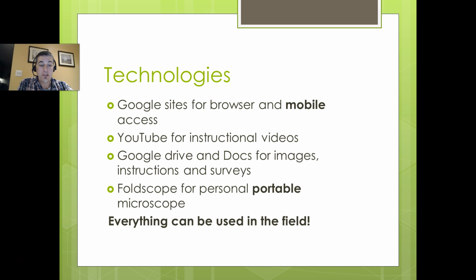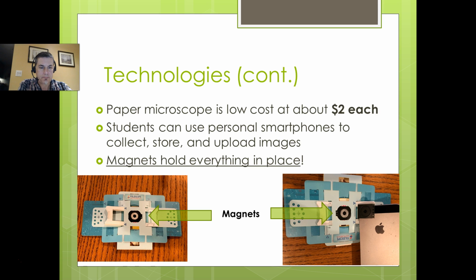Technology, like I said, everything is portable. I wanted to make it so this entire course could fit on a cell phone and walk out the door. And the microscope, because it's a portable paper microscope, can go outside and collect images and use it anywhere you want. Store the images, upload them when you get a good cell phone connection, or right there on the spot if you have a connection.